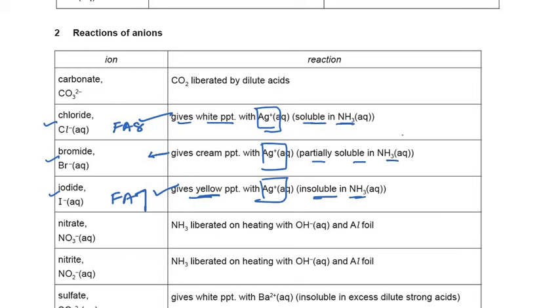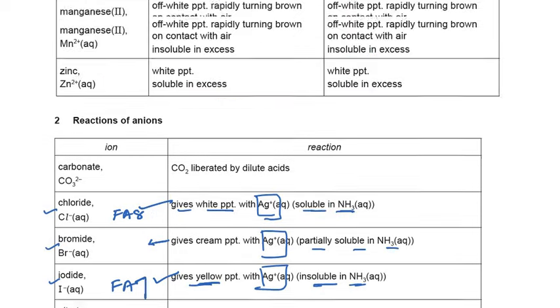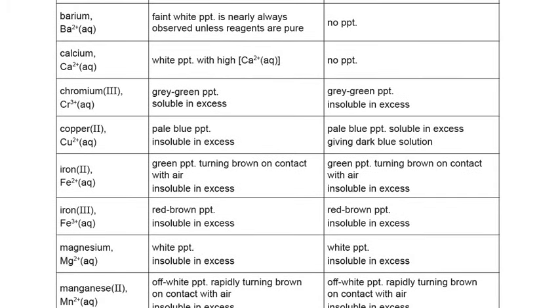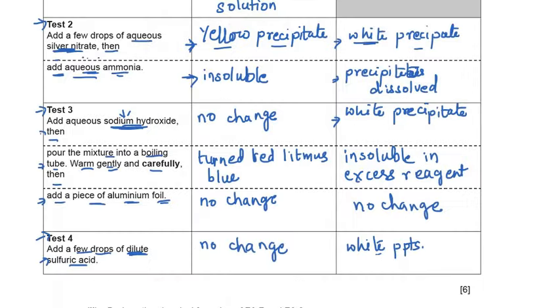And now what about the cation? With NaOH, what observation had we obtained? With NaOH and Fa7, let's check the observations again. With NaOH, that is sodium hydroxide, we had observed that there is no change, but on gentle heating the gas turned red litmus paper blue.